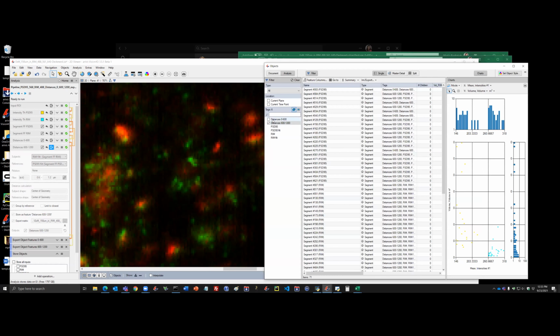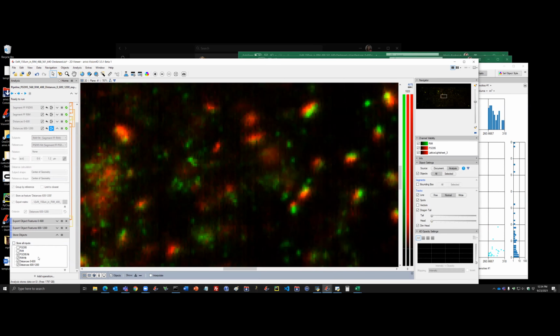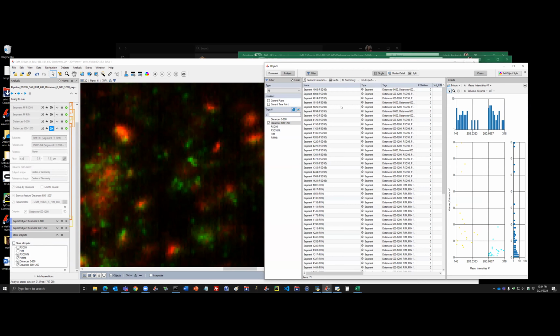We will have it stored in the objects table as well. So right now we're in the analysis mode, where this is basically access to all the segments that we are working with, but we also will store them in the very last step of the pipeline, which is always there by default. And before doing that, we can also export the existing particles into Excel or CSV tables.